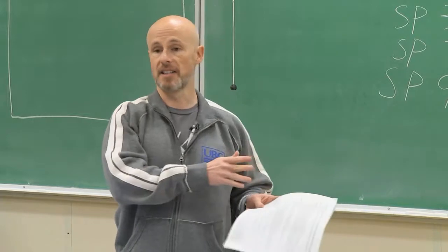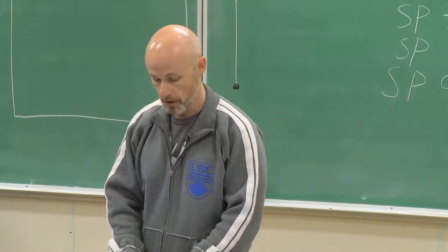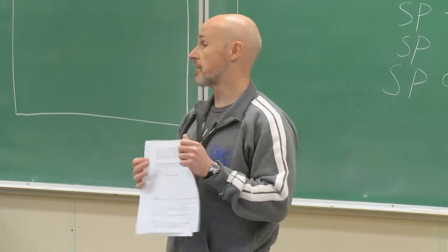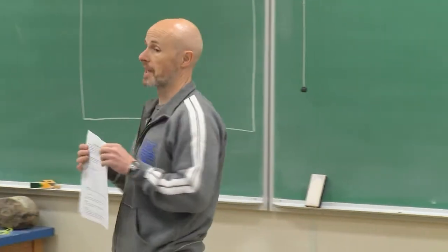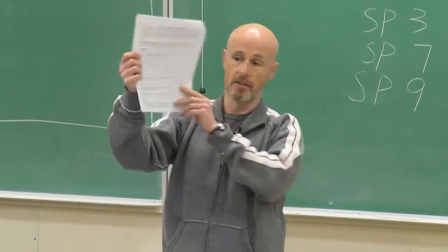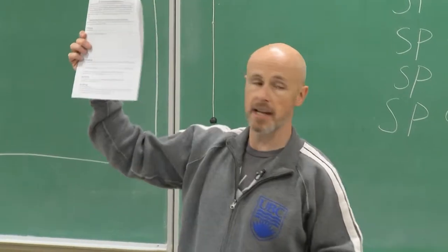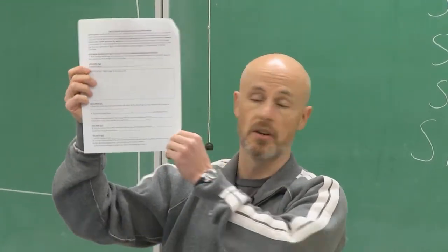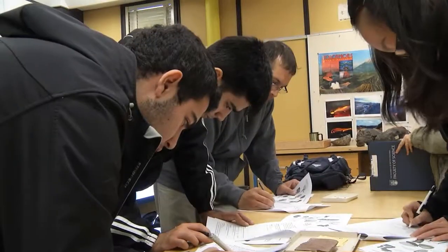Handouts were provided online several days earlier, but we still start the lab with a minimal introduction to outline the tasks, clarify time to spend on each task, and clarify homework necessary for the subsequent follow-up class. You can see here on the second page, you have a whole bunch of questions. You've got images to draw as well.